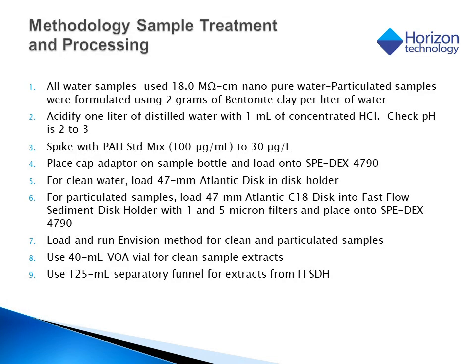This slide shows the methodology we employed and the sample treatment prior to processing. All samples were pre-treated the same way and also processed the same way, whether they were clean, distilled water samples, or samples with clay added to them for particulate load.